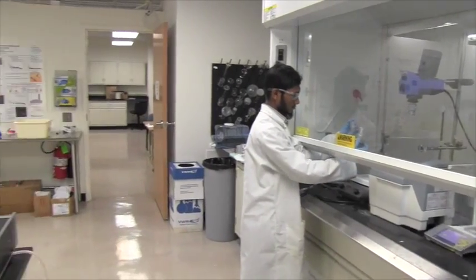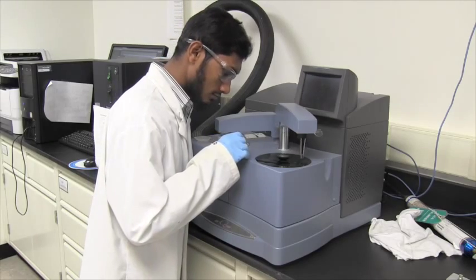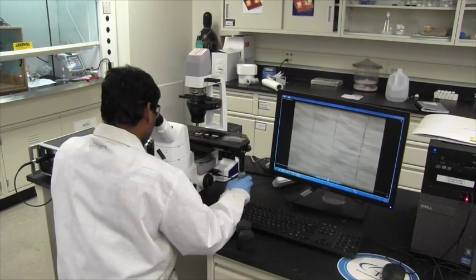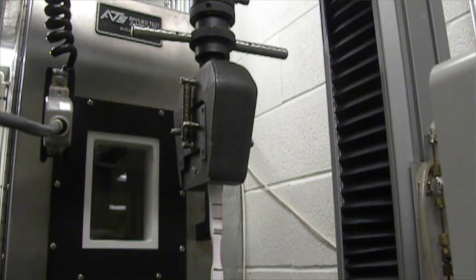The common thread to the many projects within EMC Lab is really materials and specifically functional materials. What we do in EMC Lab is anything from synthesis and processing of materials, which resides in the field of material science, to property structure, property determination, which is more materials engineering, to mechanics of materials.